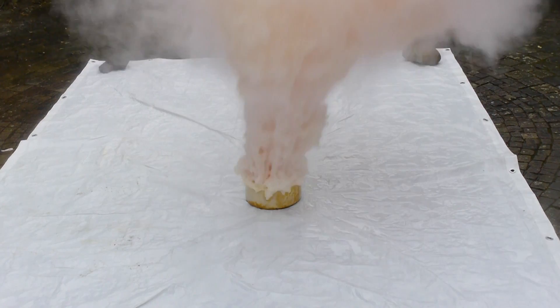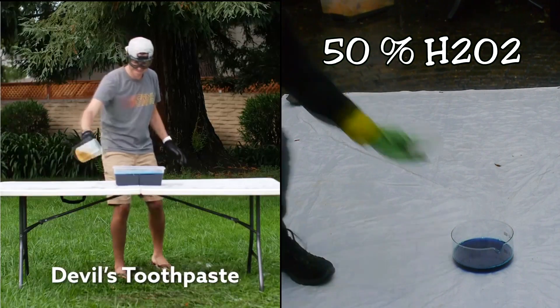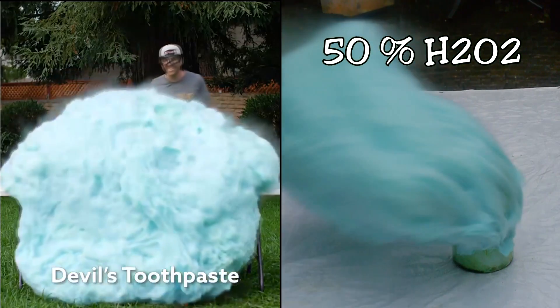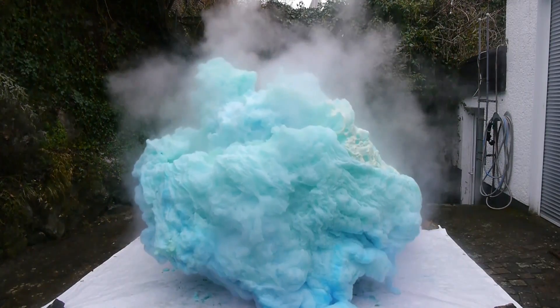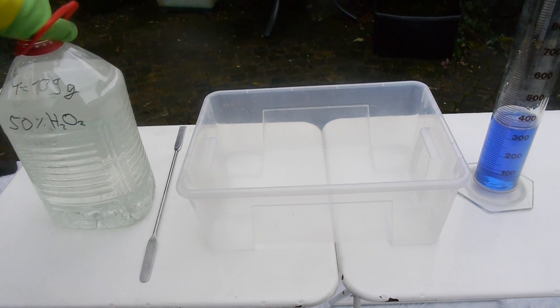Using half the amount of catalyst solution produced no effect and it was still just as crazy. After that, comparing the video footage, I was pretty much convinced that the secret to Mark Rober's Devil's Toothpaste was 50% concentrated hydrogen peroxide. In order to confirm that, I repeated the experiment on the same scale that Mark Rober did it. So let's mix up the secret Devil's Toothpaste recipe.